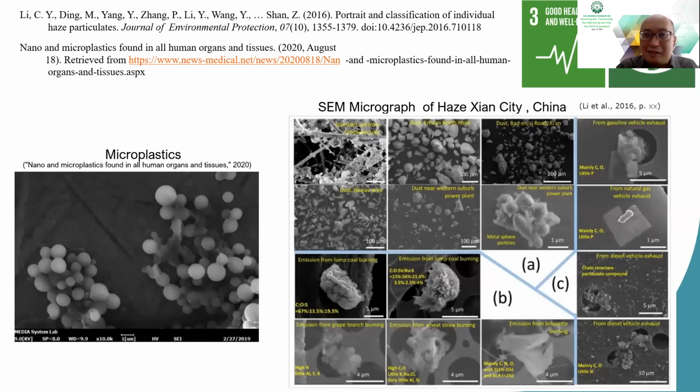It's very interesting. We would like to know the haze composition of Taal volcano in the surrounding cities. And it's also useful in studying microplastics, contaminants, and as reported before, these microplastics are even found in human tissues, which is very bad for our health.